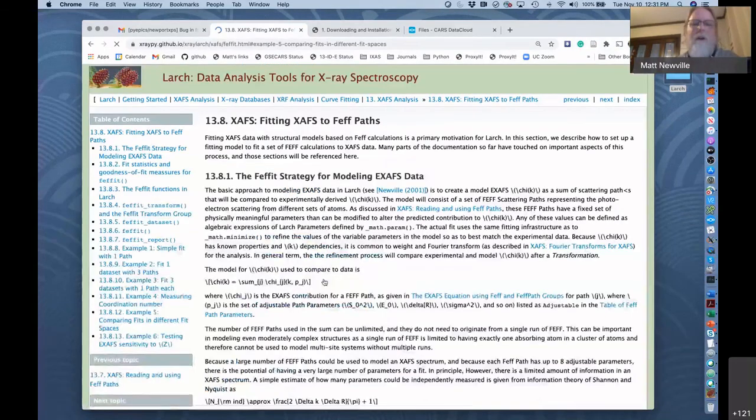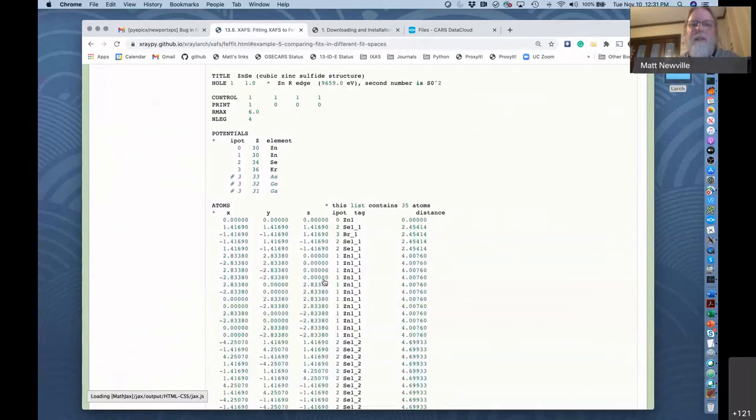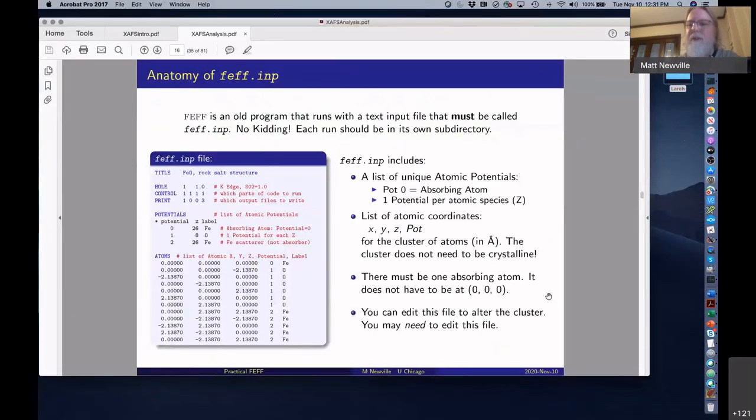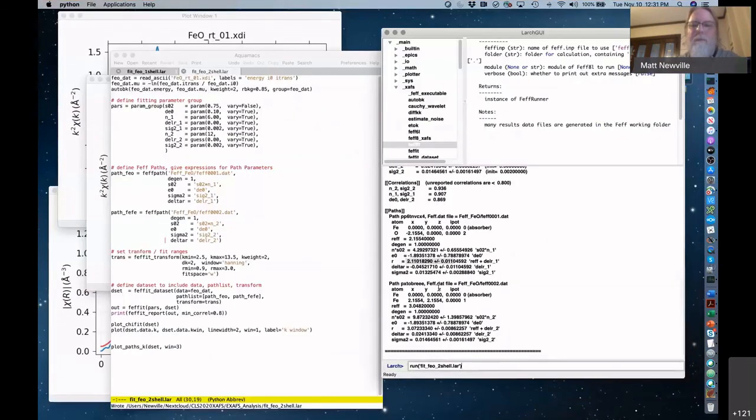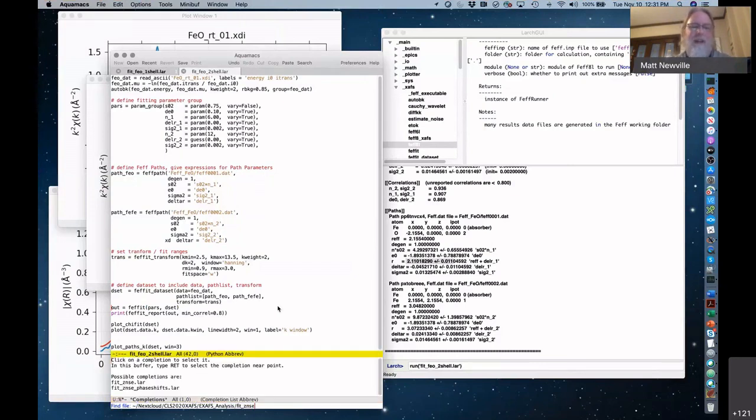I think basically all the examples I showed are similar to those data sets. And I was going to show, if there's time or interest, something else. But yes, you can specify multiple k-weights, and it's not a bad thing to do. It's a fine thing to do. I applaud that.